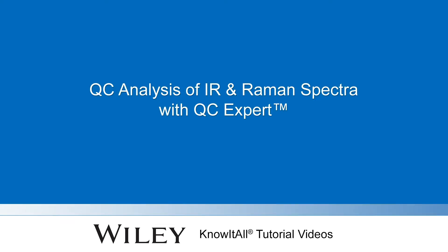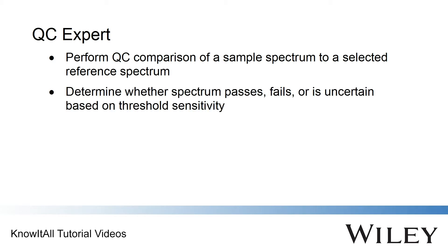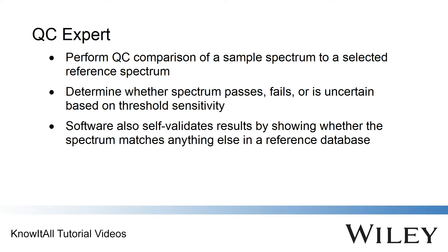Welcome to a demonstration of how to use Know-It-All QC Expert to analyze IR or Raman spectra. Know-It-All QC Expert is an application to perform a quality control comparison of a sample spectrum to a reference spectrum set by an administrator. The software determines if the spectrum passes, fails, or is uncertain based on threshold sensitivity set by an administrator, and also ensures the sample does not match anything else in a reference database set by the administrator.